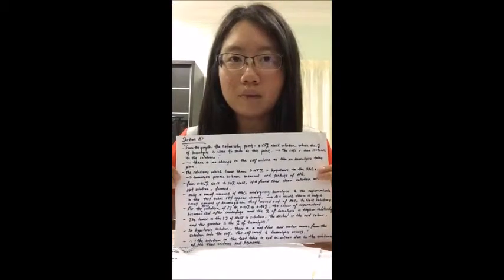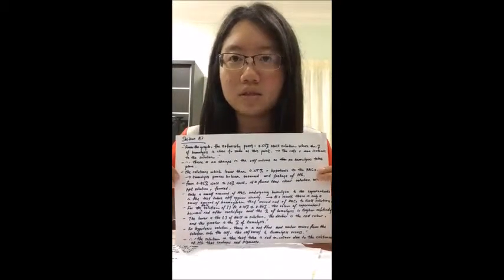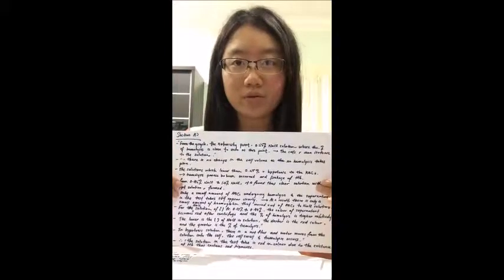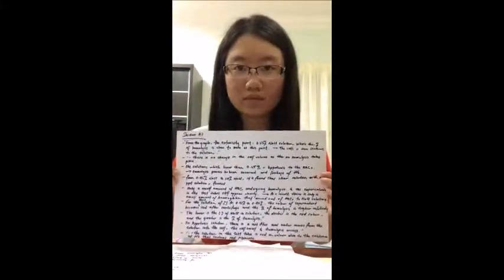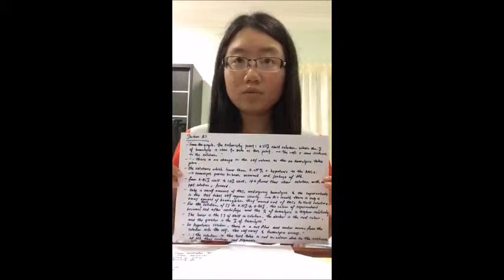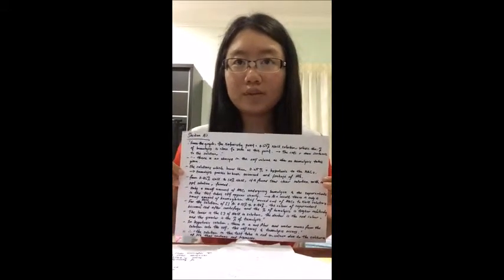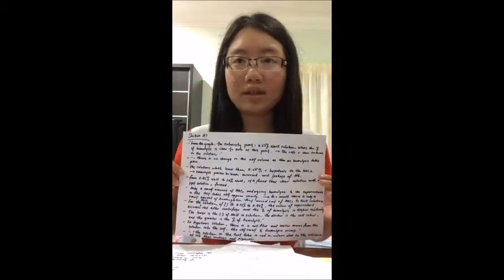There are only a small amount of red blood cells undergoing hemolysis, and the supernatants in the test tubes still appear clear. Only a small amount of hemoglobin moves out of the red blood cells into the sodium chloride solutions. For the sodium chloride solutions of concentrations from 0.10% to 0.40%, the color of the supernatant becomes red after centrifuge, and the percentage of hemolysis is relatively higher.